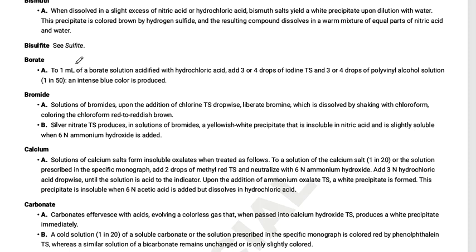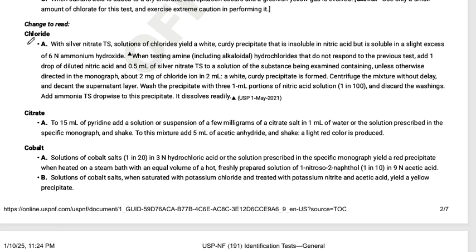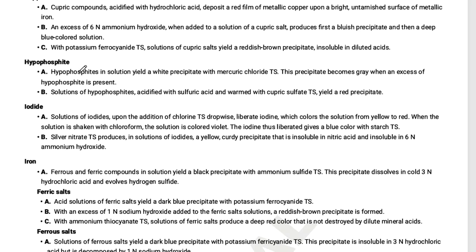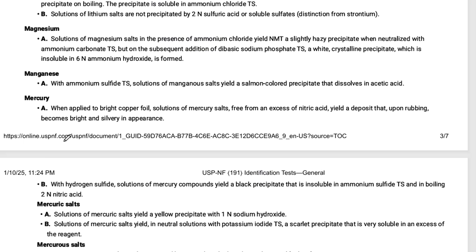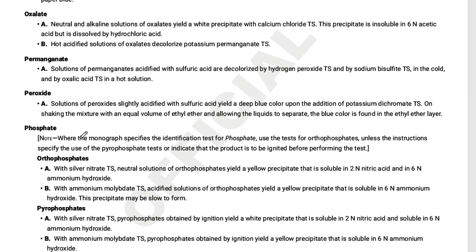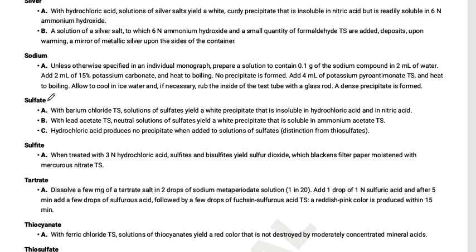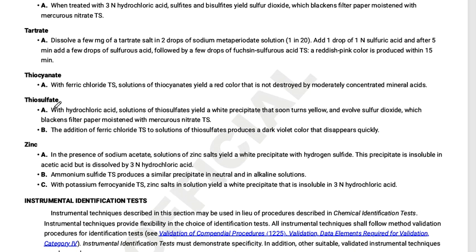As I go through: bisulfite, borate and bromide, calcium, carbonate, chlorate, chloride, citrate, cobalt, copper, hypophosphite, iodide, iron, lactate, lead, lithium, magnesium, manganese and mercury, nitrates, nitrites, oxalates, permanganate, peroxide, phosphate, potassium, salicylate, silver, sodium, sulfate, sulfite, tartrate, thiocyanate, thiosulfate, and zinc.